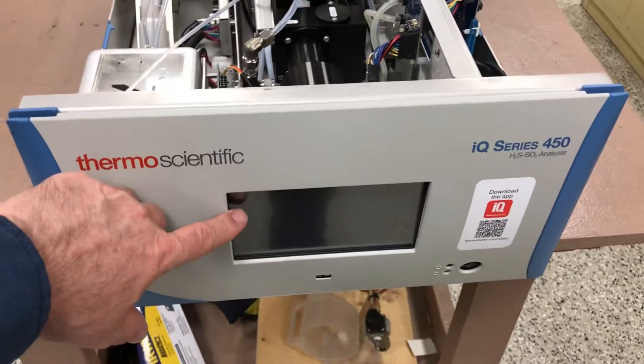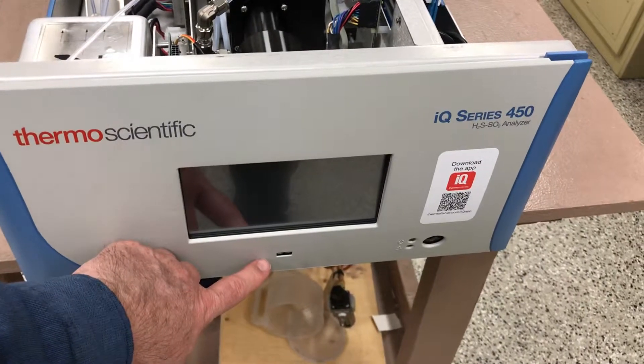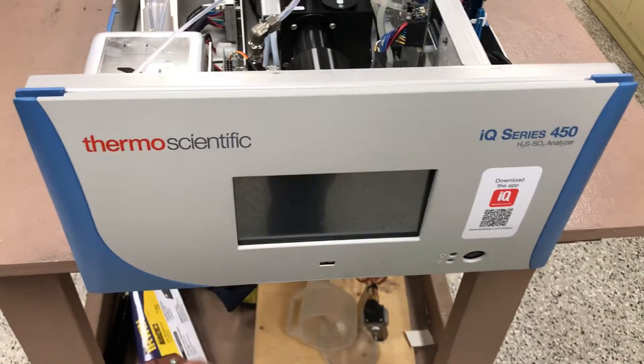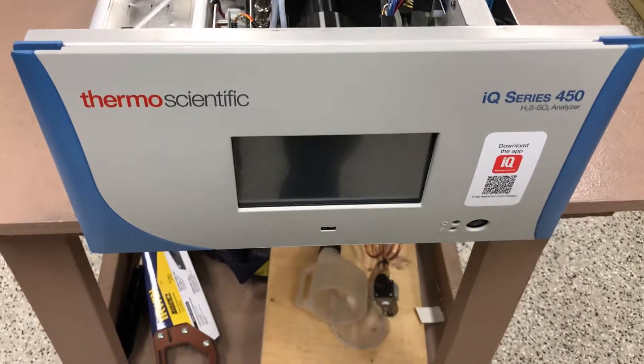It's got the centered touchscreen display and a USB port at the bottom for data download — easily done. You do not need a laptop anymore, though you can still use one. You can just use a USB thumb drive to get your H2S data off the front of this instrument.